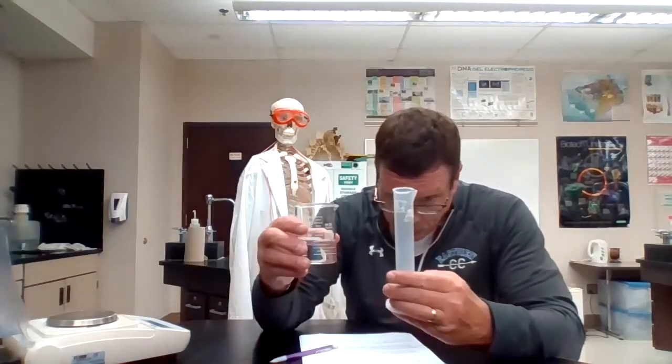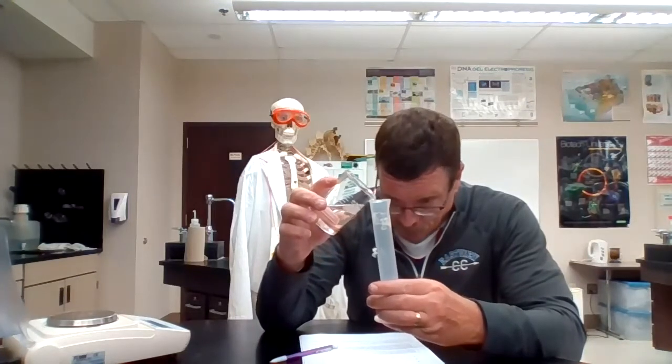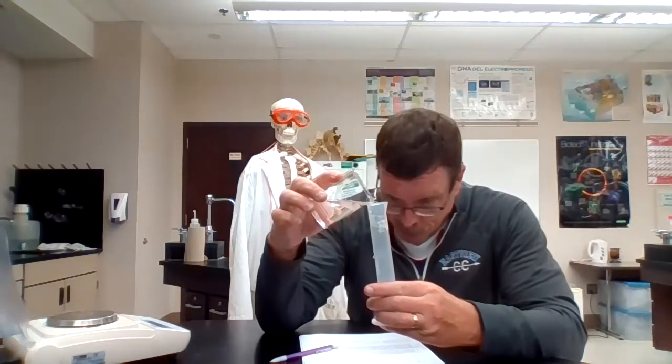But again, first, let's start by getting the mass of the graduated cylinder itself, which is 20.82 grams. So the empty mass of the graduated cylinder is 20.82 grams. And again, let me just get my 10 milliliter mark. We are going to carefully pour in 10 milliliters.